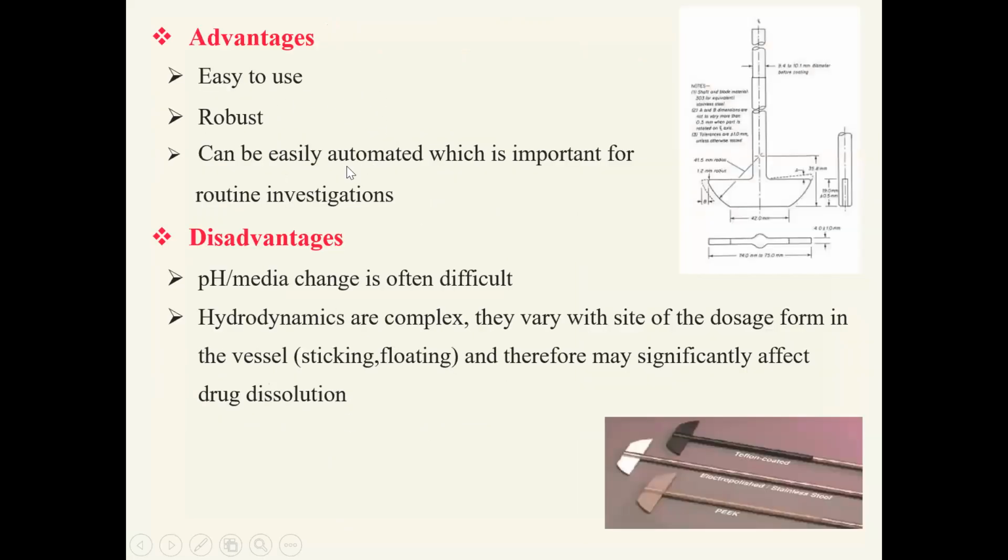Advantages: easy to use, robust, can be easily automated, which is important for routine investigations. Disadvantages: pH media change is often difficult in the paddle type of apparatus, and also sticking and floating problems are there. This will affect the drug dissolution.